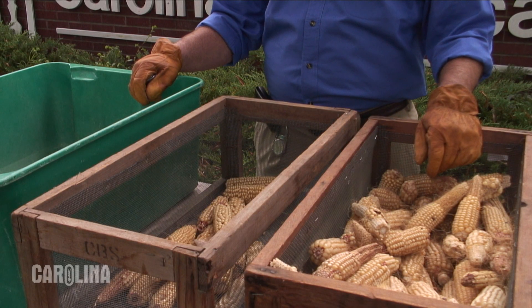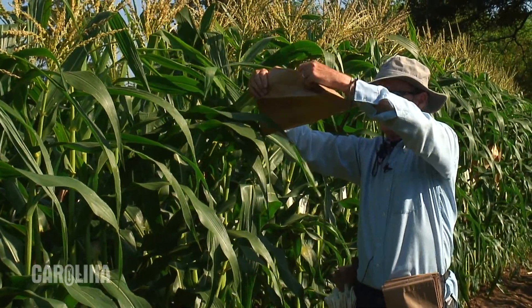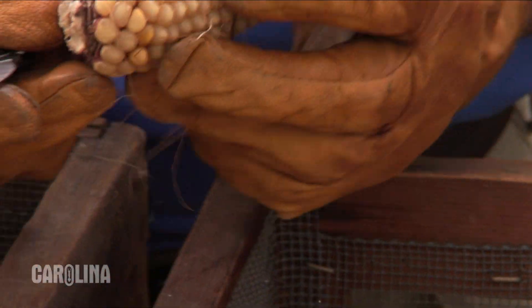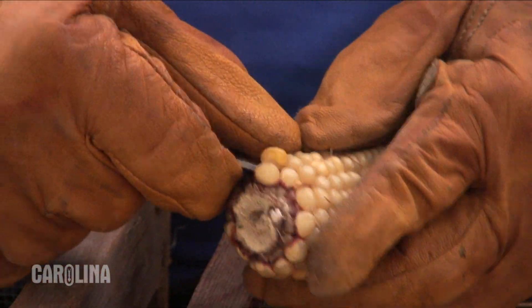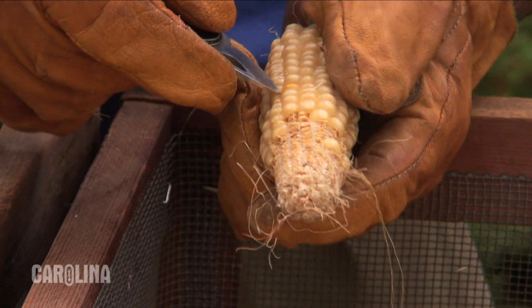All of our F1 seed is produced through hand pollinations. These are controlled pollinations. However, sometimes some contamination can be blown in by the wind during this process. During our quality control, we remove any contaminated kernels that we may find on our F1 ears. We inspect each ear by hand, looking for contamination, which is then removed. This is done so that we can make sure we get the best product possible to our teachers in the classroom.